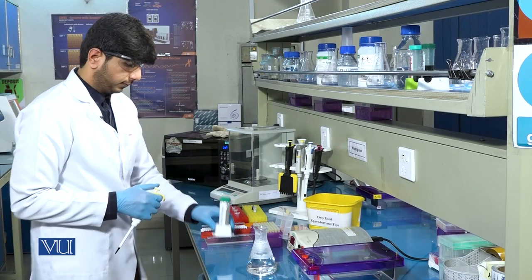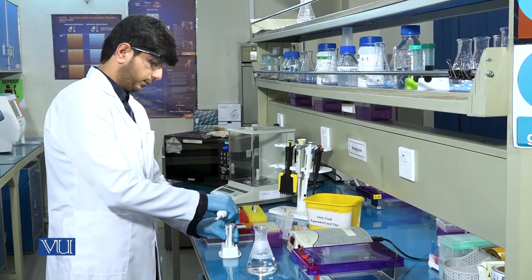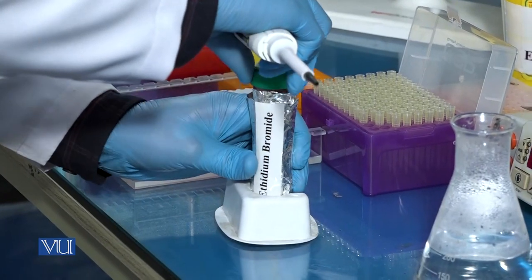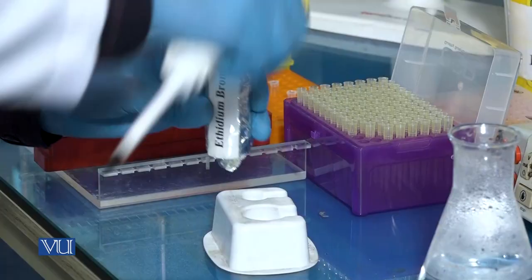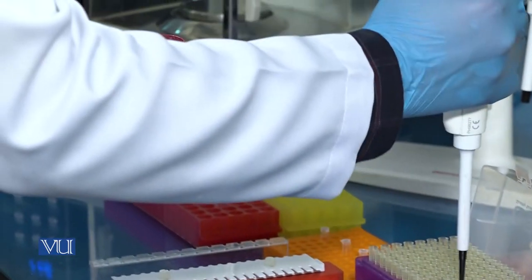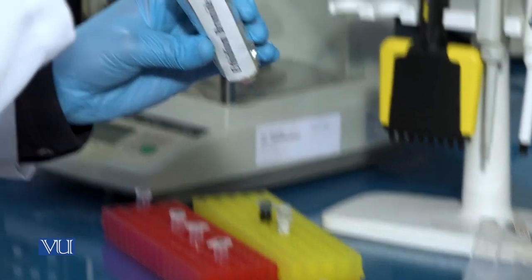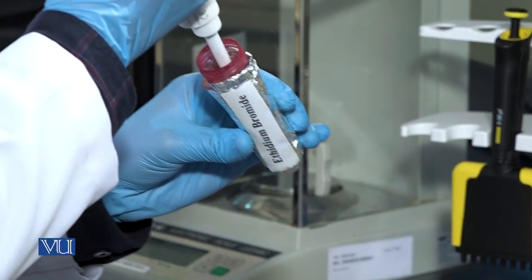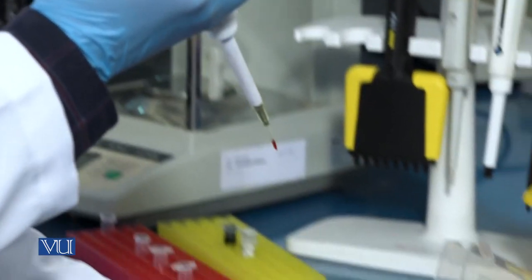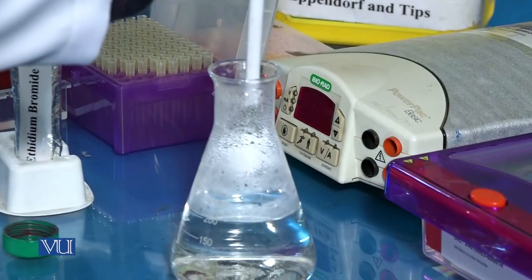Now add 7 to 8 microlitre ethidium bromide into the gel flask. It must be noted that ethidium bromide should be handled carefully because it is carcinogenic dye.